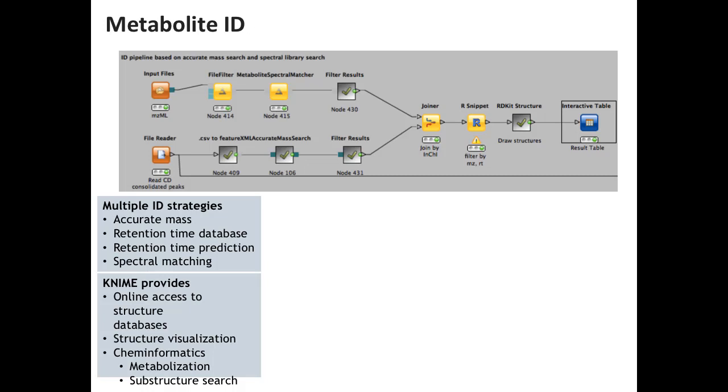You've seen that before. And these labs can then add to this spectral database everything that they identify or whatever they find that's interesting, they put into this library. And that can be done like this as well. You see there's a metabolite spectral matcher that takes basically a database and matches against that, and all these different lines of evidence can then be merged into one table.